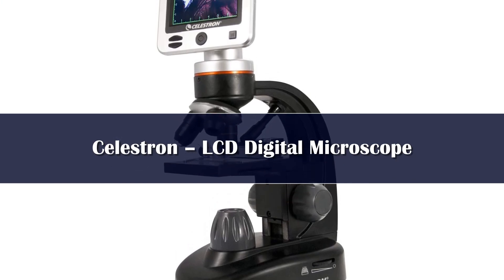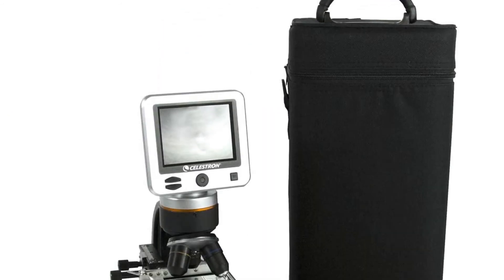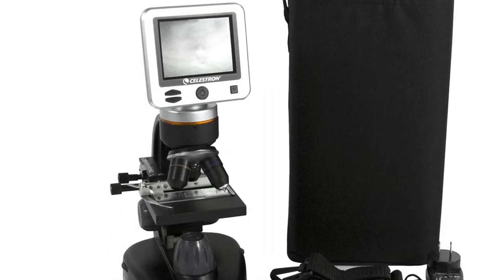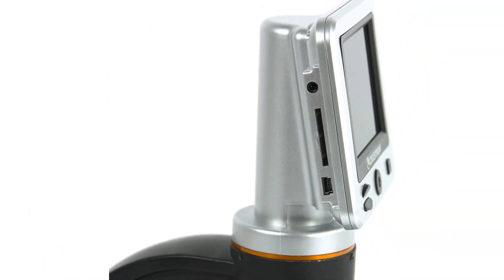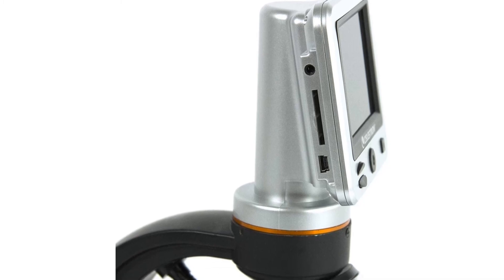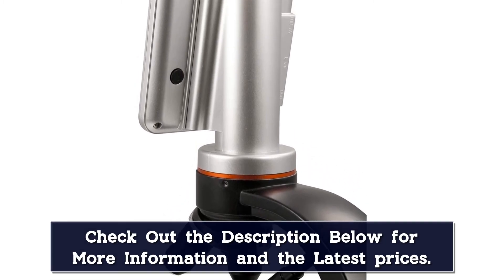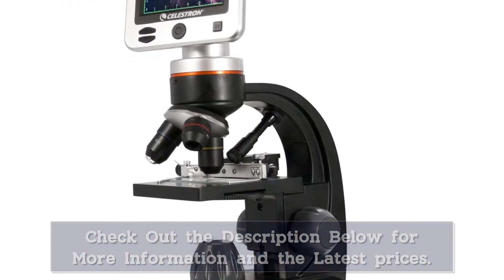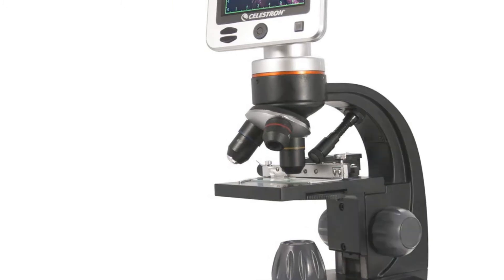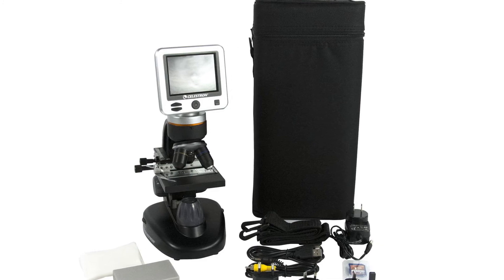Number 1: Celestron is a brand of digital USB microscopes that is a bit on the premium side, as most of its offerings are designed for heavy-duty and professional usage. This Celestron Digital USB Microscope is the most powerful option mentioned here. While it may be quite powerful in terms of magnification, you only get a small screen size of just 3.5 inches. It features a decent 5MP camera, and thanks to this camera and the high-quality optics, it is able to offer a very high zoom range of up to 1600x.